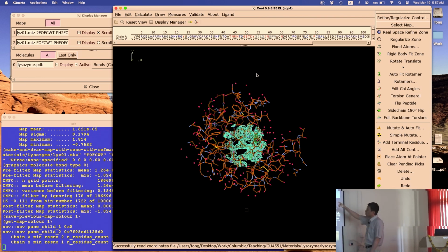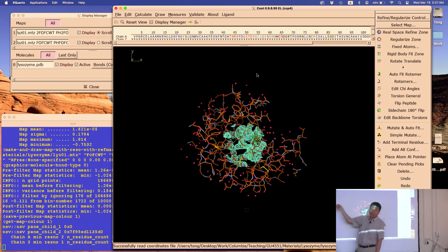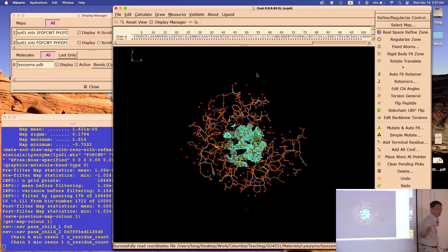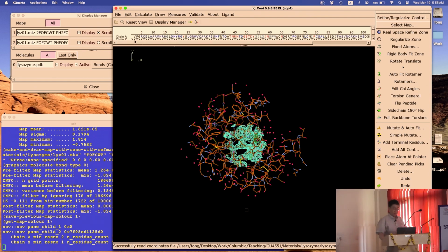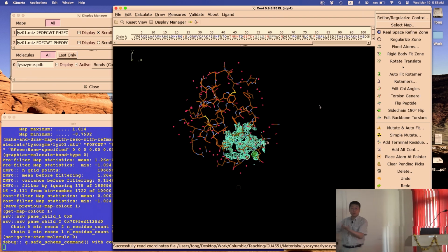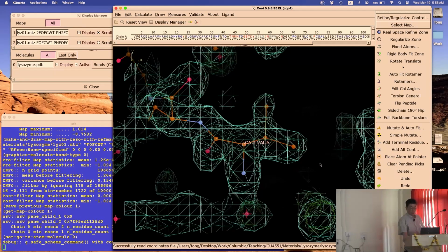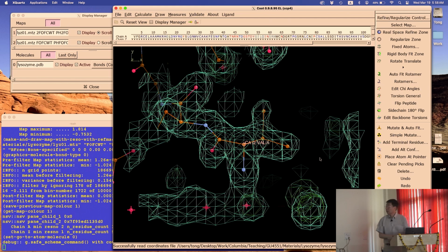Now we go to valine 2, the first valine. You can see the residue numbers on top. So the first valine, just left click on that valine. You should be centered there. This is too far away, we cannot see much. So we need to zoom in now. To zoom in, you drag with your right mouse button. Right drag. You have zoomed in now. Everybody good?